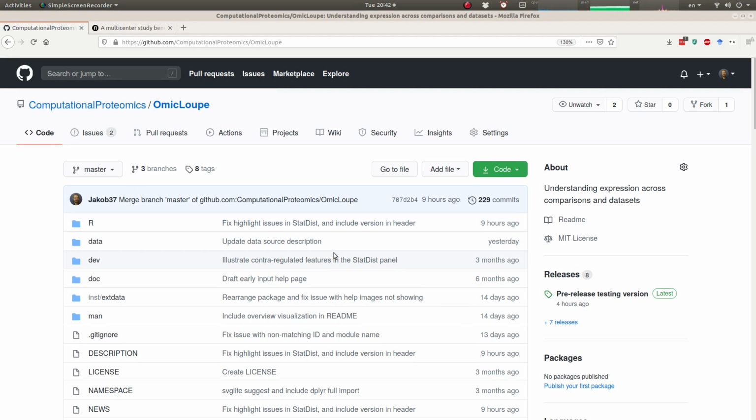In this video I will go through how you get going with OmicLoupe, and I will show you how we can load the example data that is provided together with OmicLoupe and how to get that one into the system.